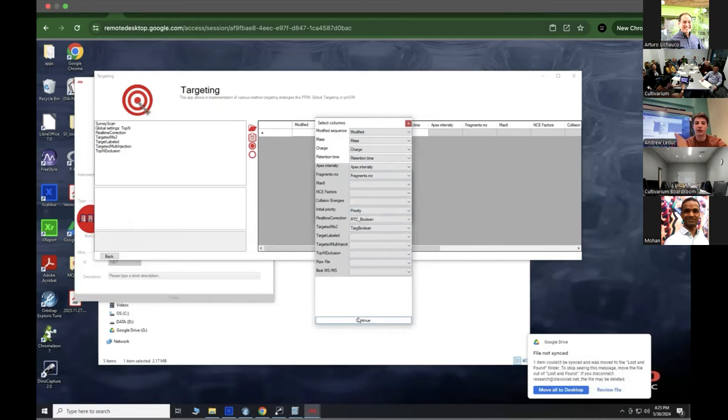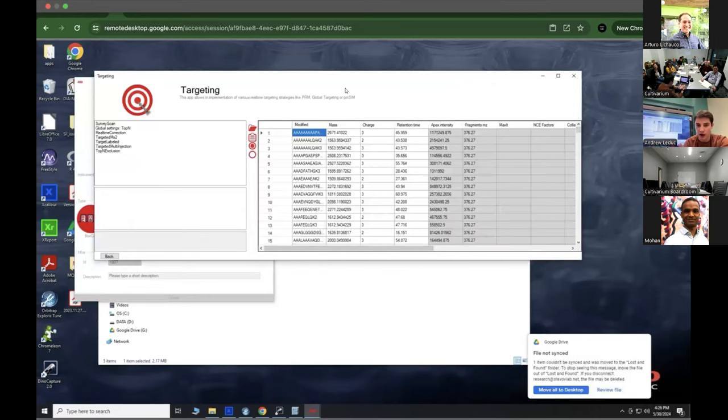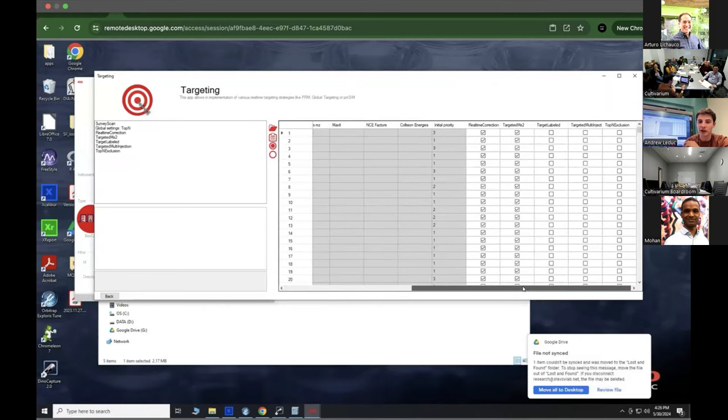I'll update this so that when this list gets produced for you, all the names are exactly what they are in MaxQuant, and then it will auto detect them, and you won't need to sit there populating all these fields. But we'll continue, hit read files, and there you go. Everything's all set up. You can see here's our priority list.